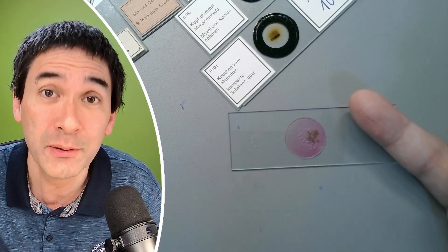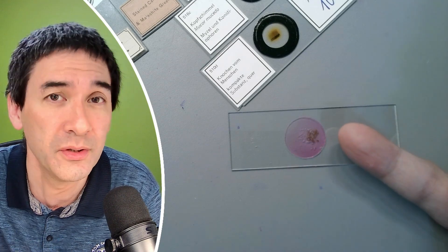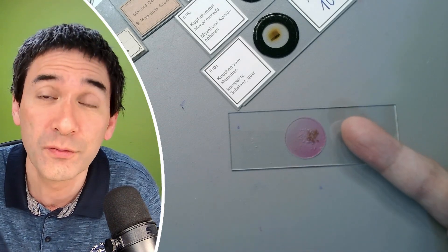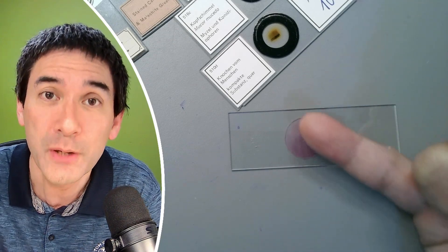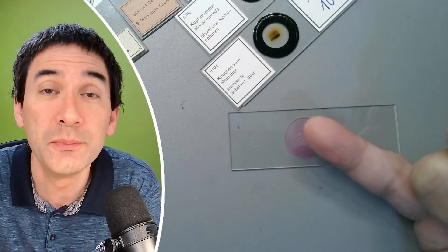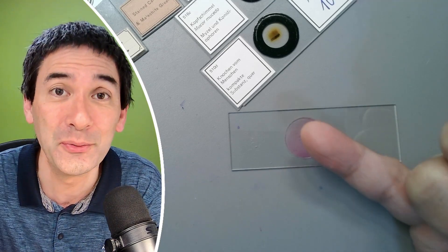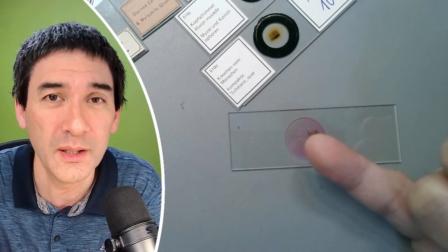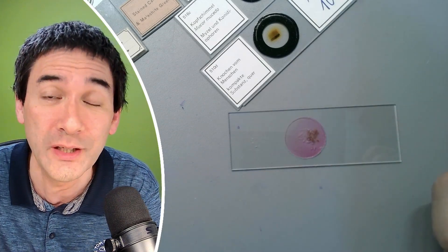And if you don't want to do that, obviously, then you have to put a ring around it also to make sure that the cover glass sticks properly on the microscope slide. And then last but not least, of course, there is a small gap around it. So it could be theoretically possible for bacteria and fungi spores, for example, to reach the mounting medium and then start to grow into it, especially because it retains some water. Now, of course, the mounting medium does contain a disinfectant. In this case, phenol. Some other mounting media contain other disinfectants. But you want to make sure that the slide is stable over a long time. And for this reason, it would be a good idea also to put a ring around it.